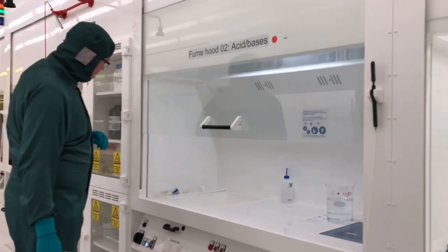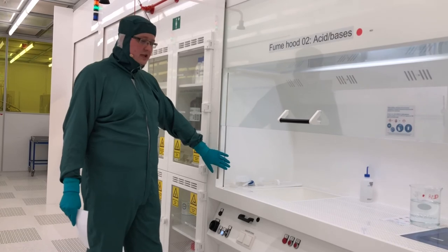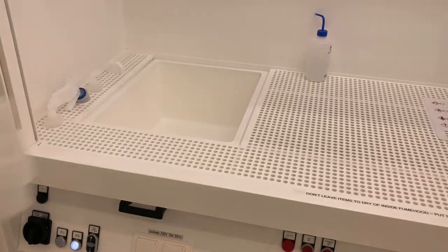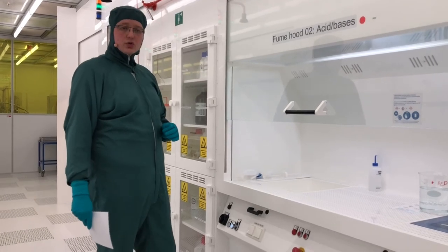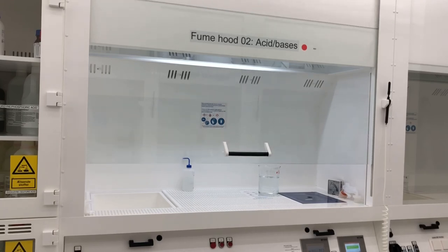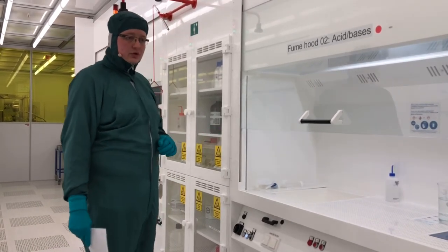Finally, watch out that you do not block the sash opening. There is an optical path that checks whether anything is blocking the sash — even a small item like a wafer box, a DI water hose, or a glove will block the sash opening. This means you will not be able to close the sash with the down arrow, and you will also block the standby function. If the fume hood is unused for some time, the sash closes automatically, ventilation goes into standby, and energy is saved. So do not block the sash opening.